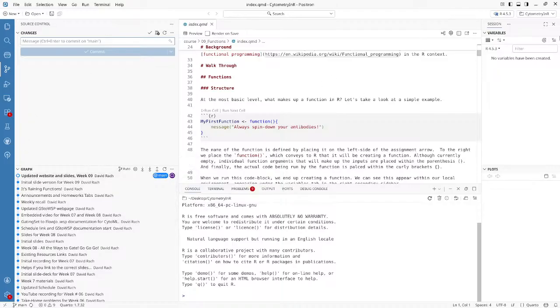So as much as possible, always just bring in the data to the CytometryInR folder, but always go ahead and copy those over to your own working project so that you're not running into these potential conflicts.